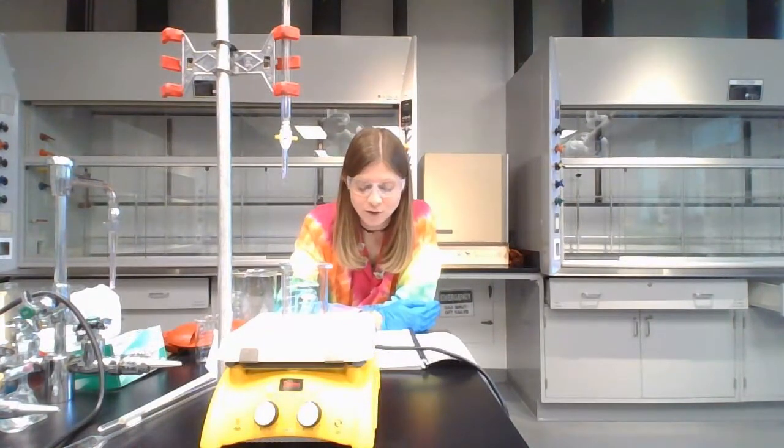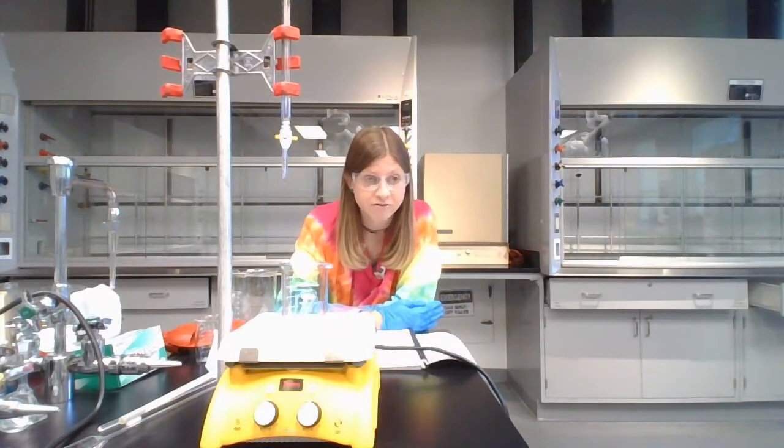Okay, so spills of potassium permanganate, which is the purple stuff, must be cleaned up by being sprayed with oxalic acid and then wiped down with paper towels. Spills of sulfuric acid should be cleaned up too. If it's a very small amount, like just a drop or so, it can be cleaned up with paper towel and deionized water. But if it's more than that, we have acid neutralizer. We will pour it on the sulfuric acid to clean it.